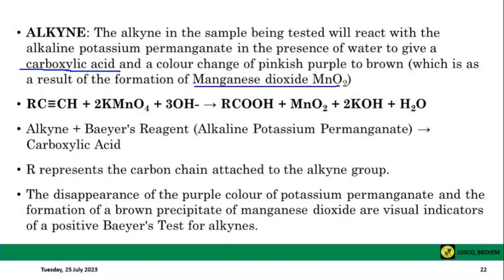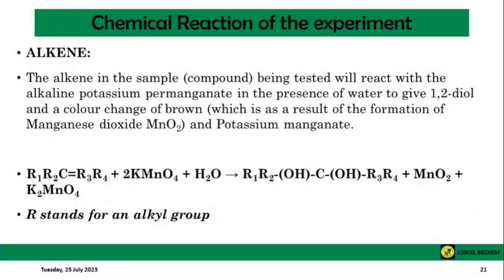Now, this time around, the color change is going to be from pinkish purple to brown. Remember that for the alkenes, the color change would be brown.